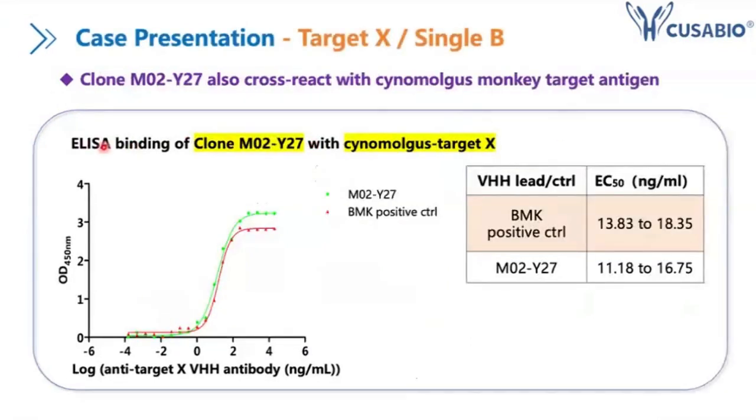that this one also cross-reacts with the monkey target antigen. In this project, at the very beginning, we did not aim to select one that cross-reacts with human and monkey, but we were surprised to find that it has very good performance. So I will focus on this one.